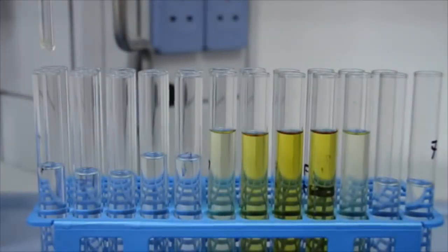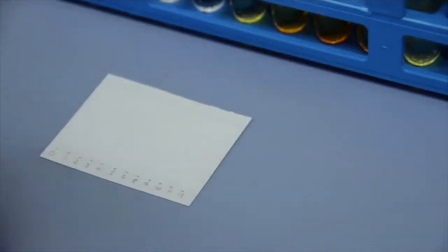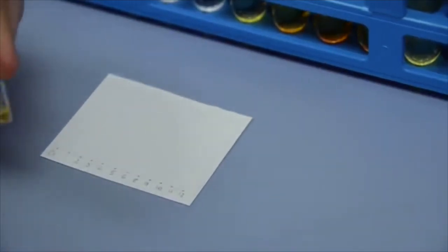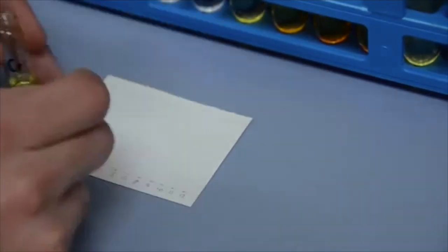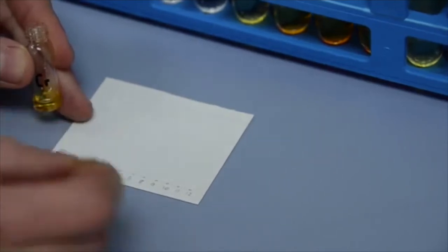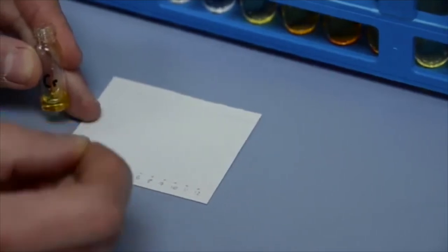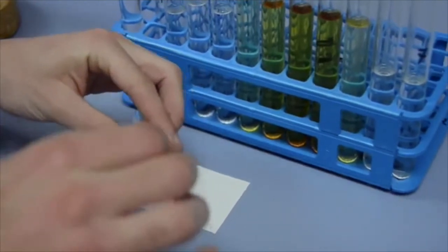Once around 10 to 12 test tubes are filled, prepare a wide TLC plate and mark starting points for each of the test tubes and another spot for your crude mixture. Spot samples from each test tube and run the TLC. Once you develop this, determine whether a fraction of your mixture is eluting out or not.